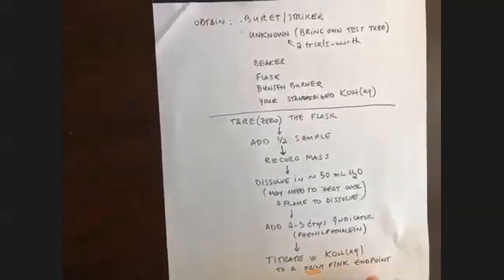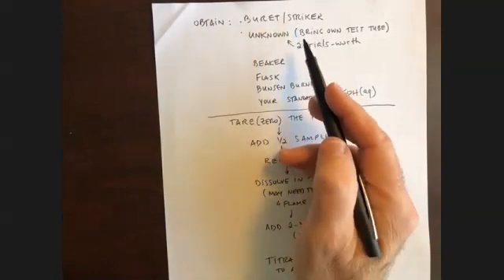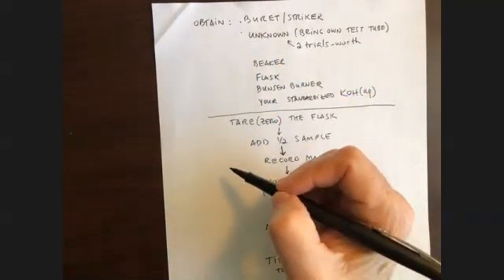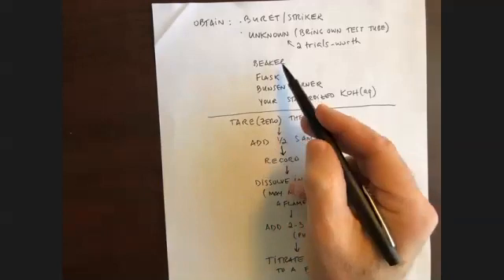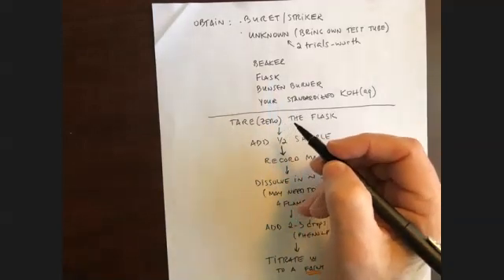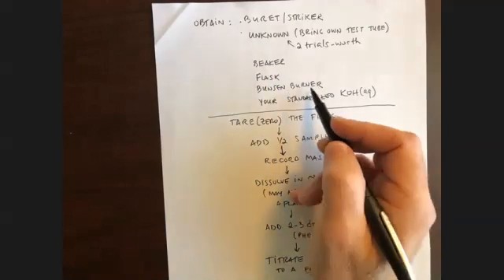Okay. So if you were doing this in the lab physically, you would be getting from our stockroom window a burette and a striker for your Bunsen burner. You'd bring your own test tube and you'd be given a sample of unknown. You're going to be given enough for 2 trials. From your equipment in your drawer or somewhere else in the lab, you'll have to get a beaker, a reaction flask, typically your 250 milliliter Erlenmeyer flask, which the video that I refer you to calls a conical flask. You may need your Bunsen burner.